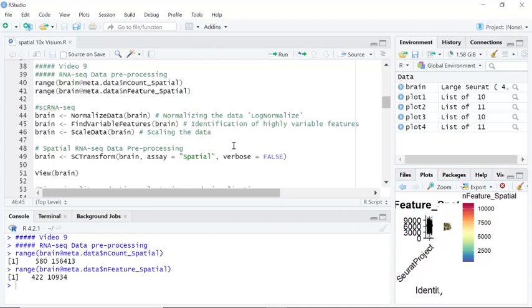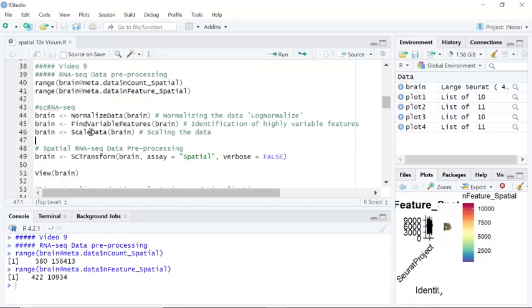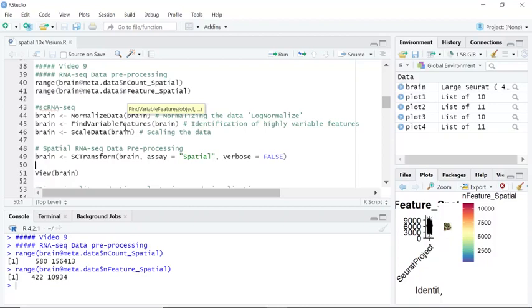The SCTransform function not only normalizes the data, but at the same time it also finds variable features and scales the data. So we just need to run one function, SCTransform, to perform data normalization, find variable features, and scale the data.